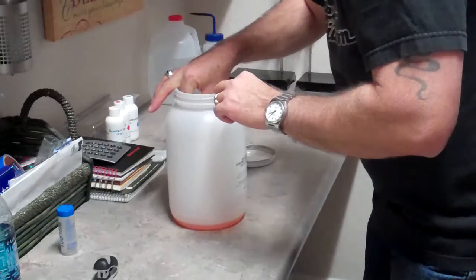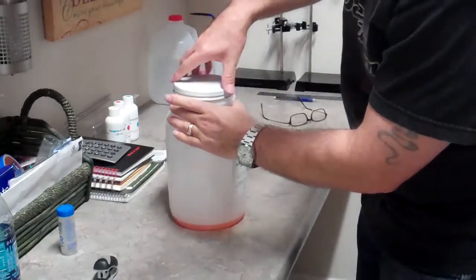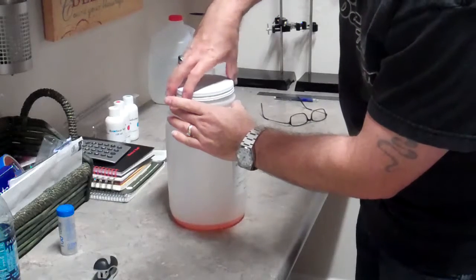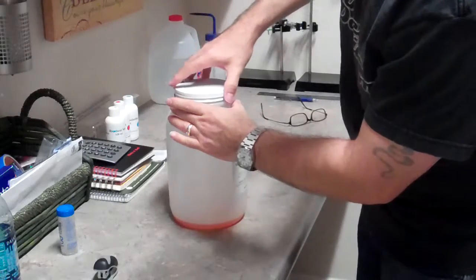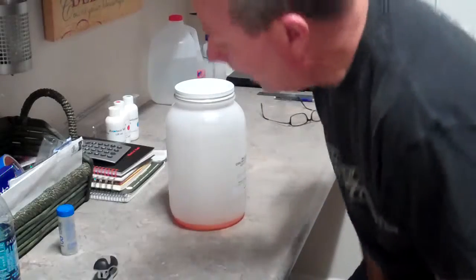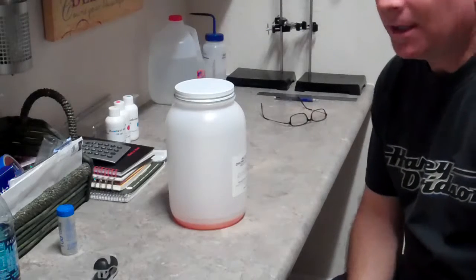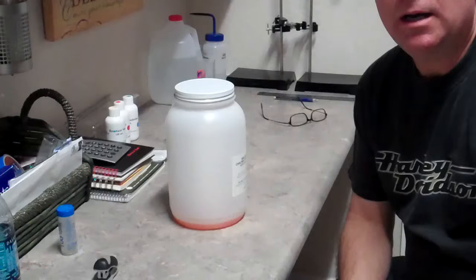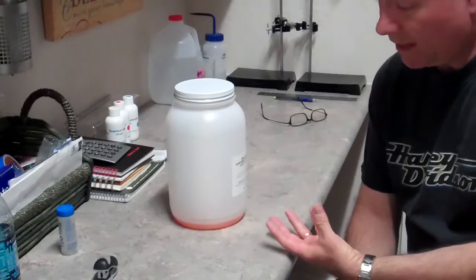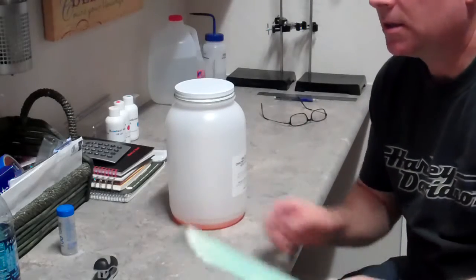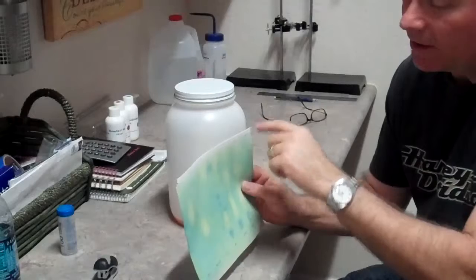We're going to very gently set this down into the center of our gallon container. We're going to put the lid on because we want to contain all the vapors inside, because that's part of how this works. We're going to let this set for three to five hours approximately. You can let it set overnight; it's not on any time thing.